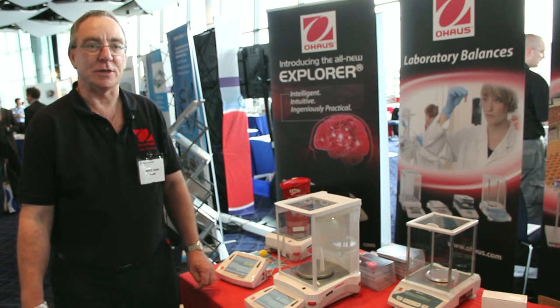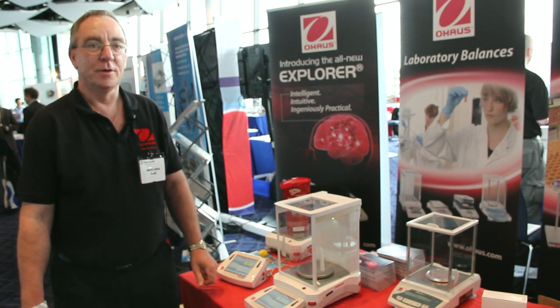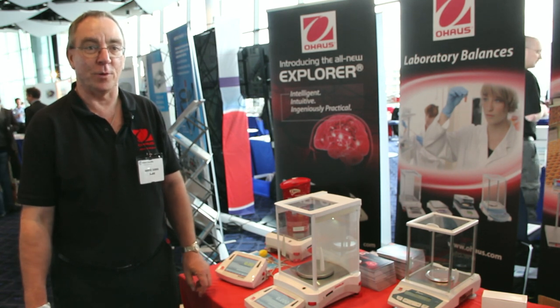Capacity is ranging from 10 kilos to one decimal place through to 300 grams to four decimal places.